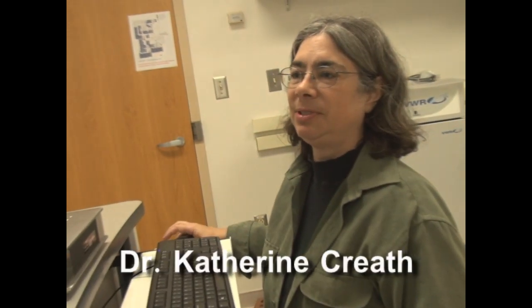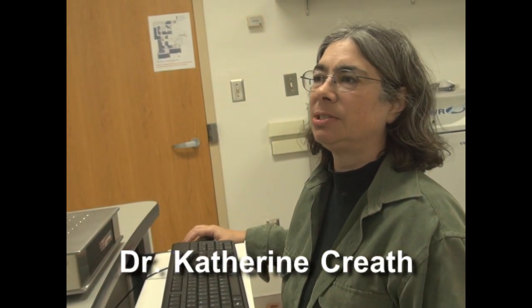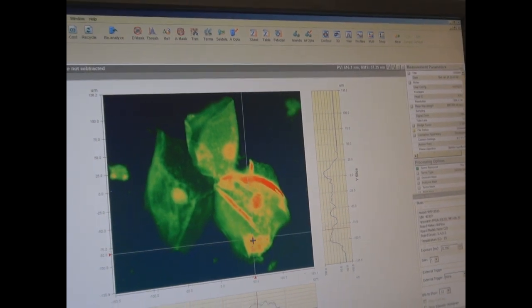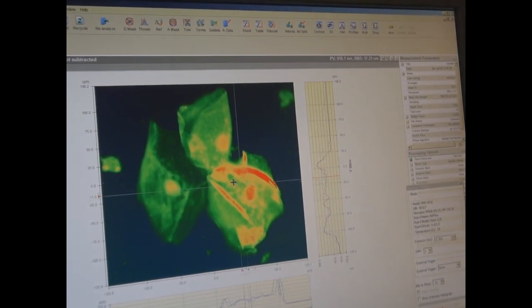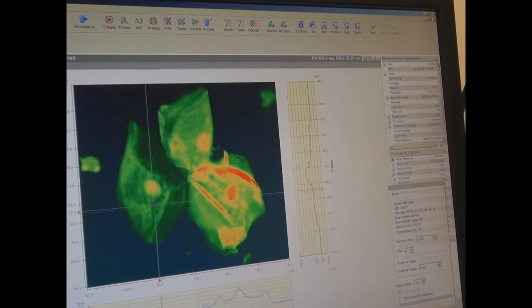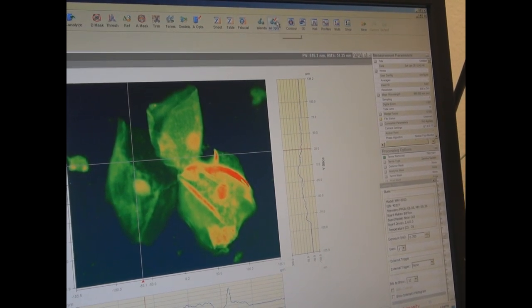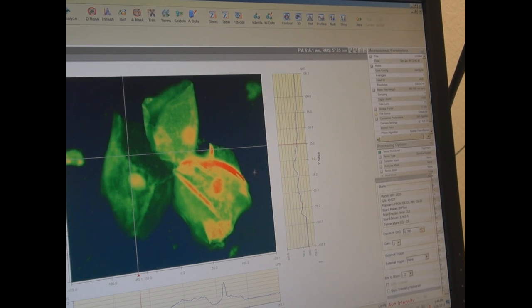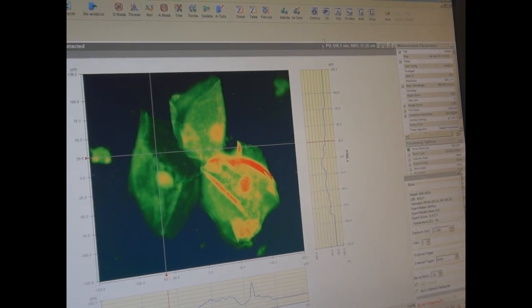Here's a measurement of a group of cheek cells. Here's the contour plot and we can look at the optical thickness at various points within the cell, and we can see different kinds of organelles and nuclei inside the cell. We have a resolution here of about one and a half microns.